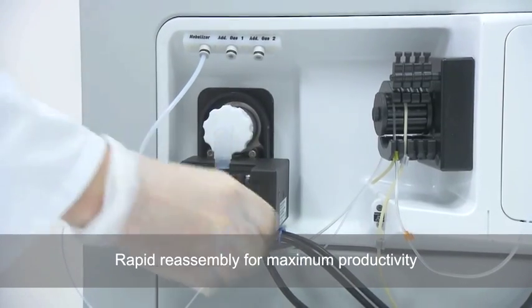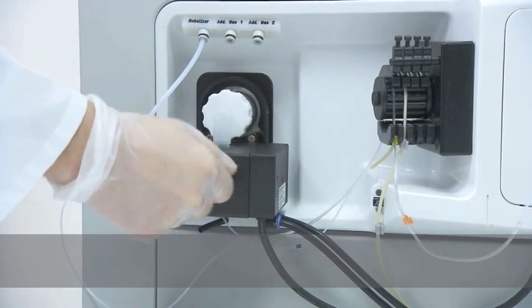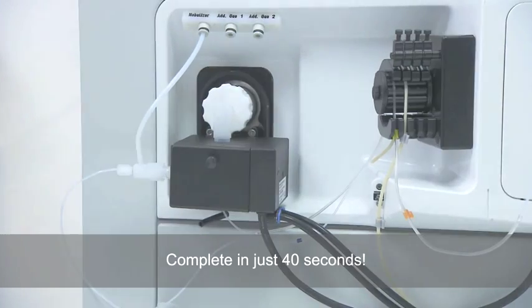Rapid reassembly of the sample introduction system ensures maximum productivity. Complete and ready for analysis in just 40 seconds.